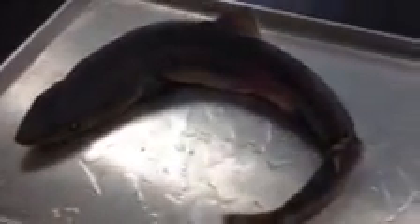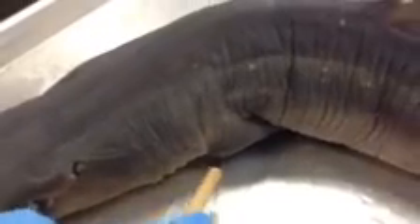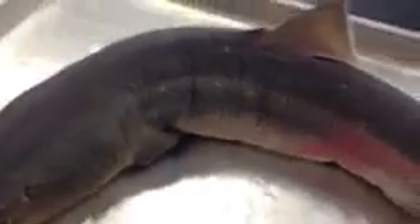And then we have the pectoral fin right here, and it's also on the other side. We have some slits over here and they're the external gill slits.